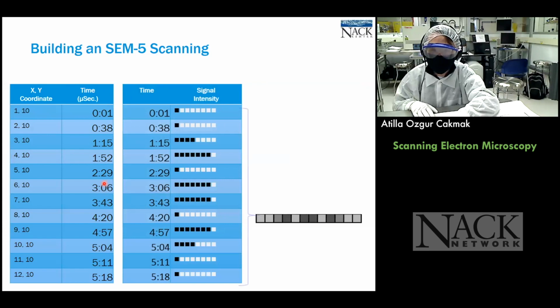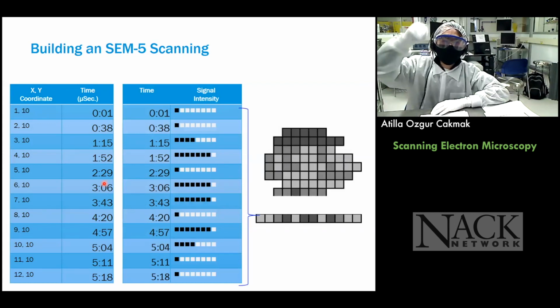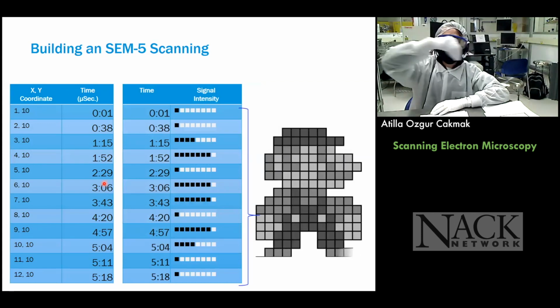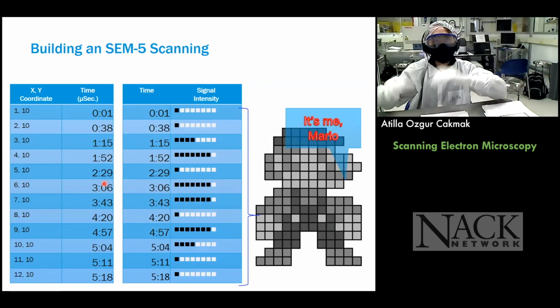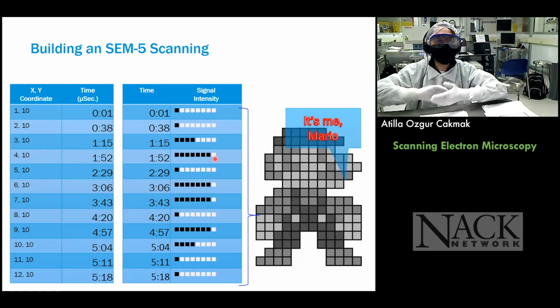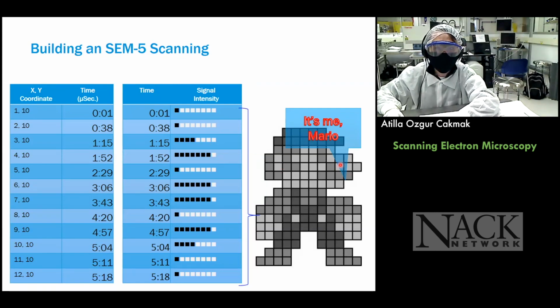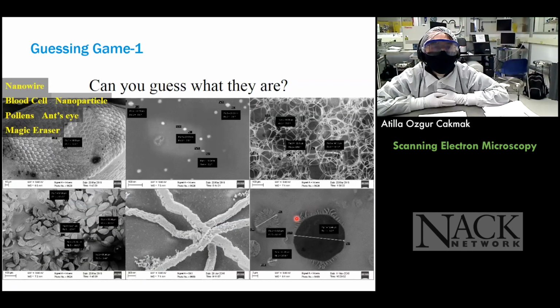Yes, this is again Mario. This is going to show you how we do the scanning. We will put the electron beam in different locations and scan each line, and then put the image together to form the final image. From this particular pixel, let's count the bright ones, we got 4 coming out. The other area will give me, as an interaction, only 1 electron coming back, so we get to form the whole thing.